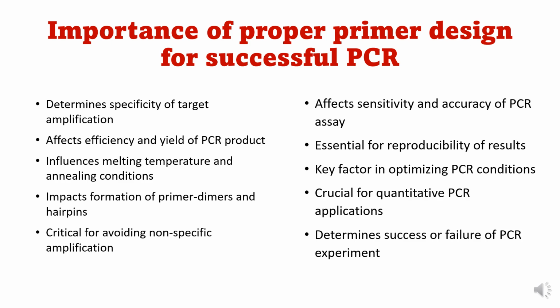So these are the details which need focus in primer design, which is fundamental for amplification in diagnostics, research, and forensics, where accuracy is paramount.